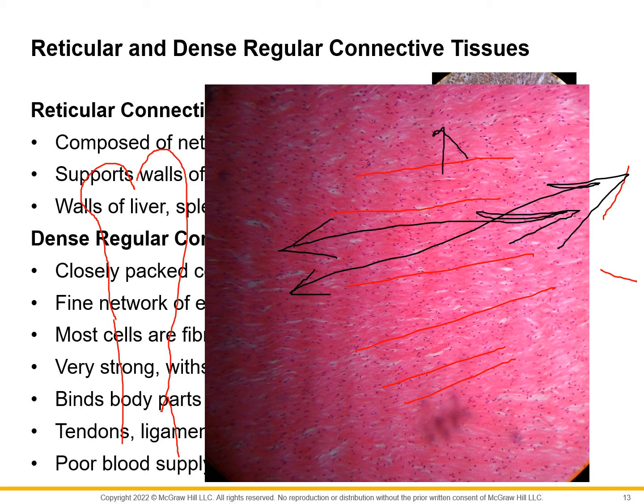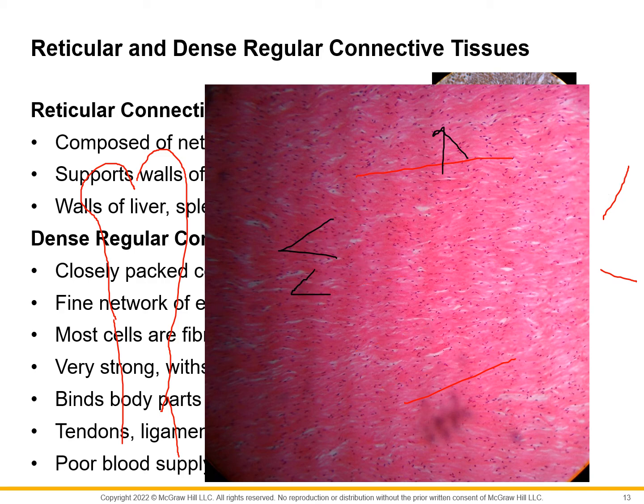It's giving up strength in the others. That's why, if you twist your knee or something happens with any force, it can snap, simply because it's not strong in the other directions. And again, I hope all that makes sense. But dense regular connective tissue, densely packed, regularly aligned fibers, is the tissue of the tendons and ligaments.